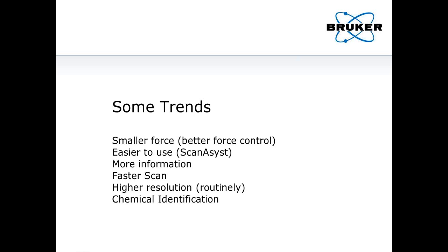If you think back about how AFM evolved, you can see the AFM technique itself goes from contact mode to tapping mode and then PeakForce Tapping mode. And really it centers around this: how do you control the force better? How can you precisely control a small force?